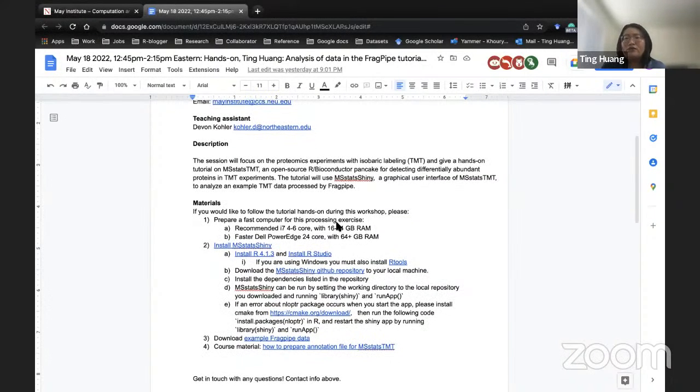I believe you have already installed MSstats Shiny, but I saw some issues asked in the Q&A about the installation. So if you have a problem today, I would recommend you just do it again.